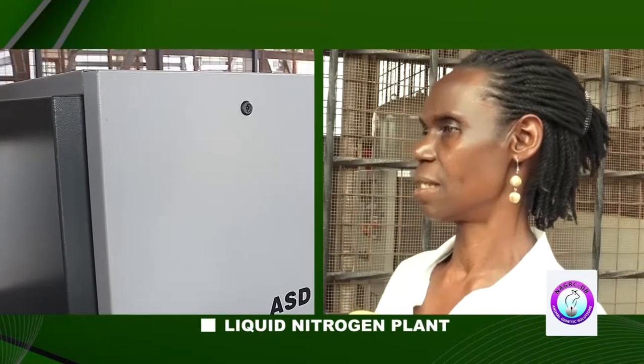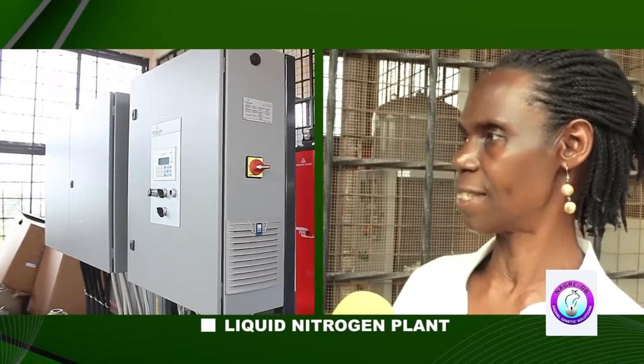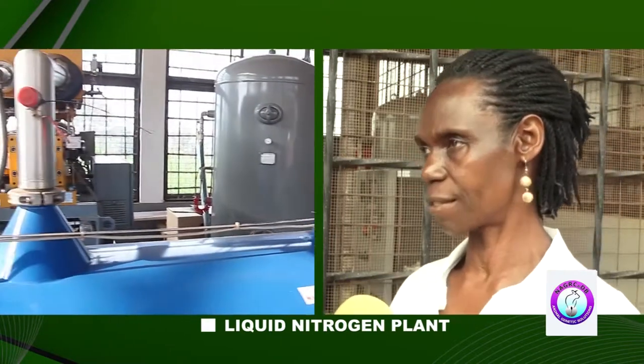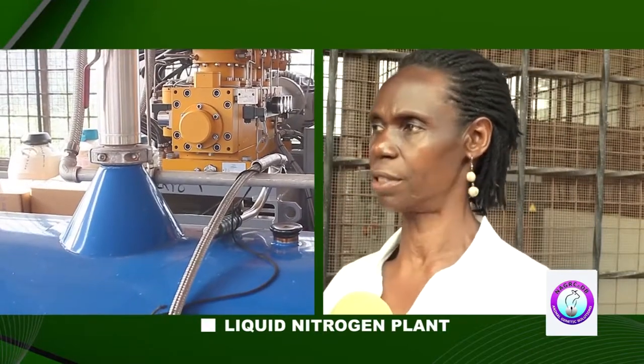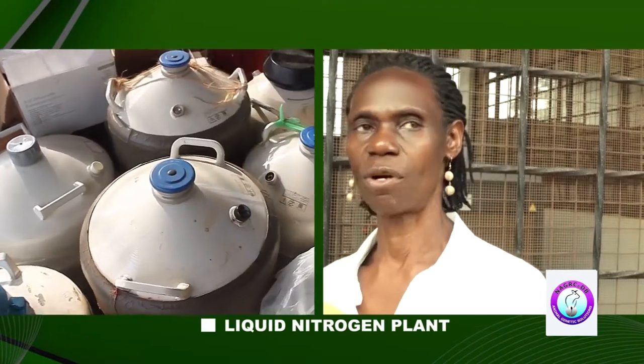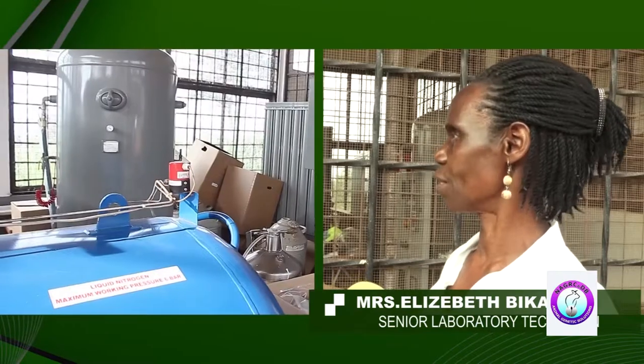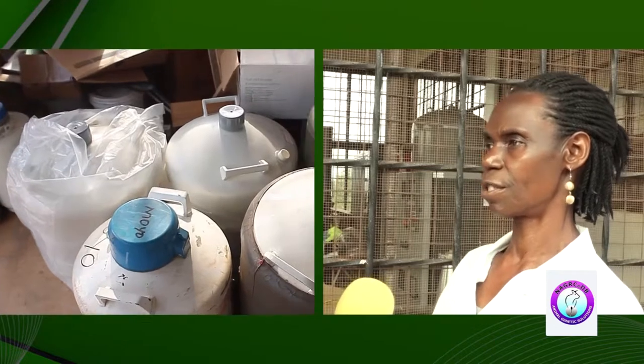Dry nitrogen gas is put within the cryogenerator. The cryogenerator is supplied with chilled water from chillers. That water is supposed to go around within the cryogenerator to remove the heat. Because as we are working, there is a piston and displacer that work together, compressing the nitrogen gas. So it creates heat, and the chilled water is the one that removes that heat. We remain with a good temperature for turning into liquid nitrogen. At a temperature of negative 196 degrees Celsius is where the nitrogen is produced from gas.